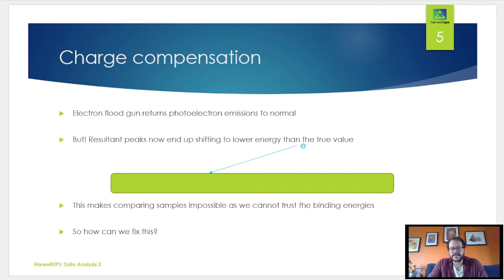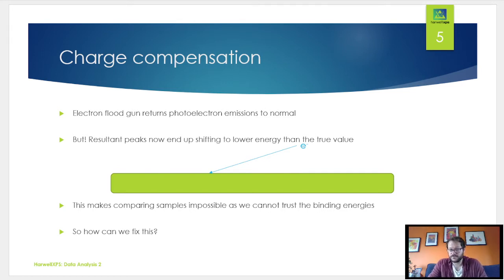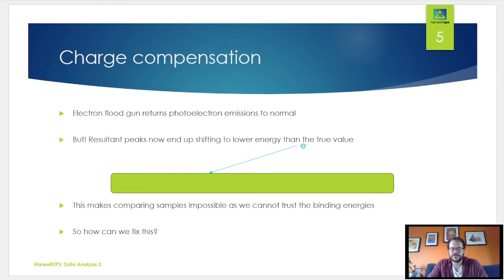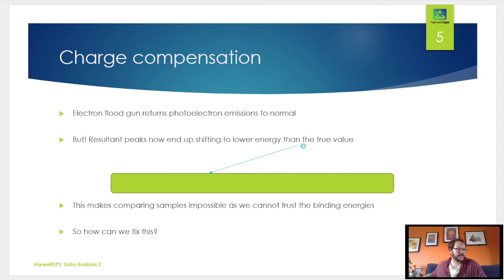The electron flood gun floods electrons to the surface and neutralizes the positive charge buildup. The problem is that this tends to shift binding energies to lower values than they should be. Some systems get around this using a dual neutralization system - a combination of electrons and argon ions to bring the surface back to neutral. But even still, it's definitely recommended to check the calibration and make sure nothing is amiss.